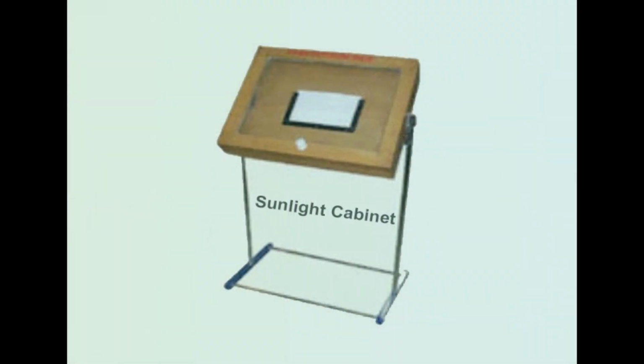A sunlight cabinet may be used as an instrument to identify the color fastness towards sunlight. It is a wooden box with a glass top having a stand. To test for fastness to light, the fabric sample is half covered with opaque paper and exposed to the outdoor light for 48 hours.